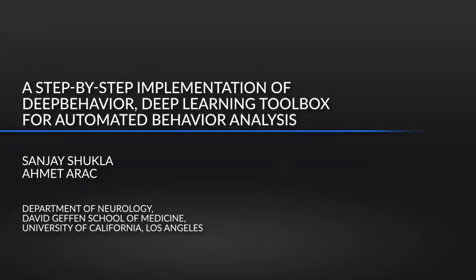Performing a detailed behavior analysis is crucial to understanding brain-behavior relationship. One of the best ways to evaluate behavior is through careful observations. However, quantifying the observed behavior is time-consuming and challenging. Classical methods of behavioral analysis are not easily quantifiable and are inherently subjective.